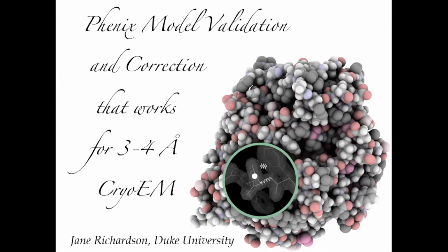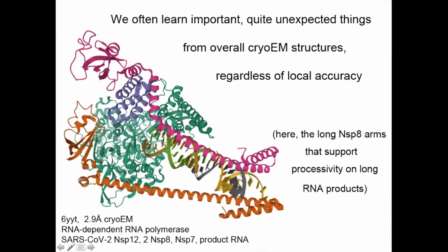And so there are mostly things that are multi-residue validations. I'll explain how the traditional tools work first, and then I'll show you new tools and how you can use those. And this is still a work in progress. We can't fix everything. You never can fix everything, but it's proceeding, and there are a lot of things that can help you.